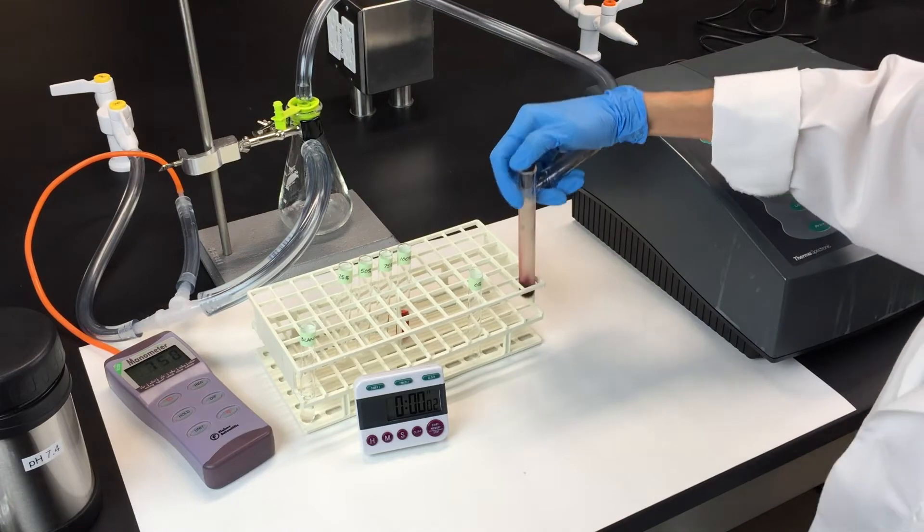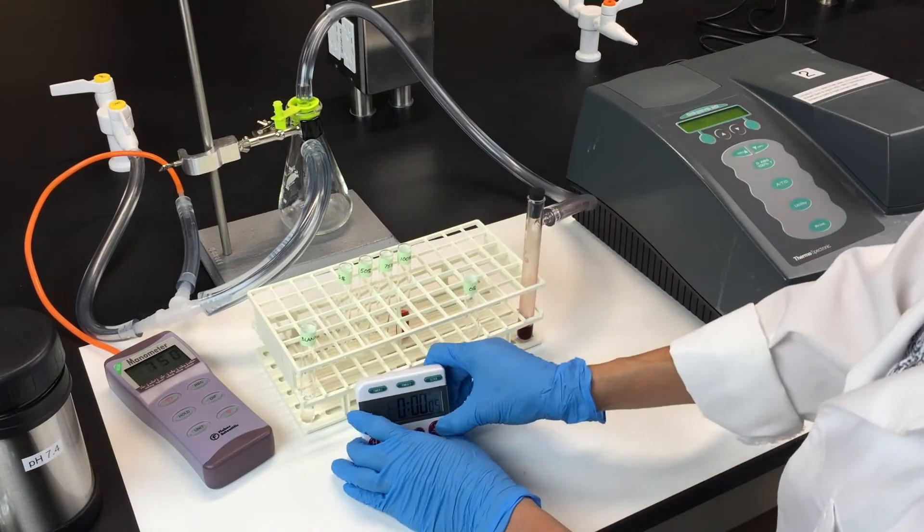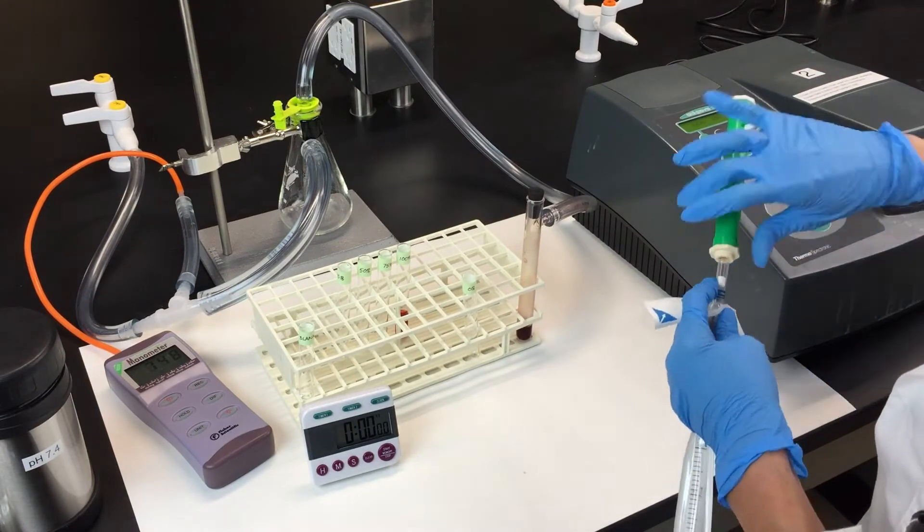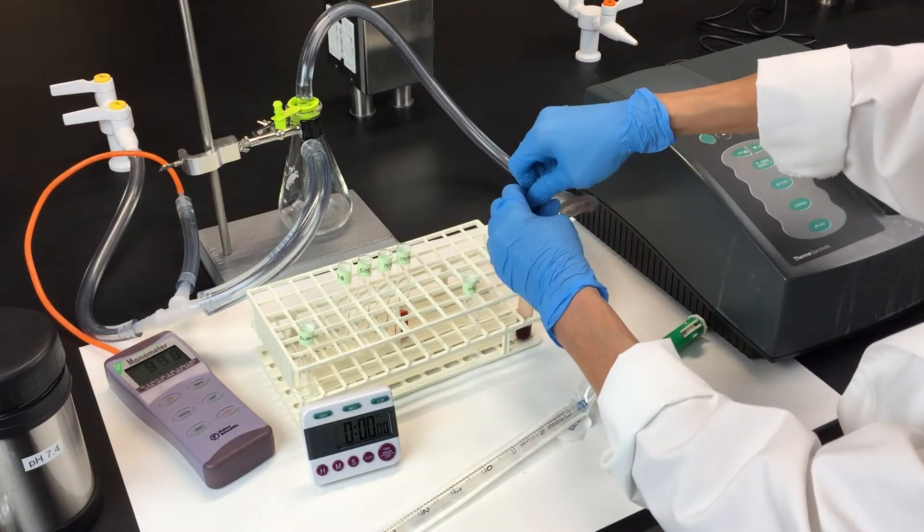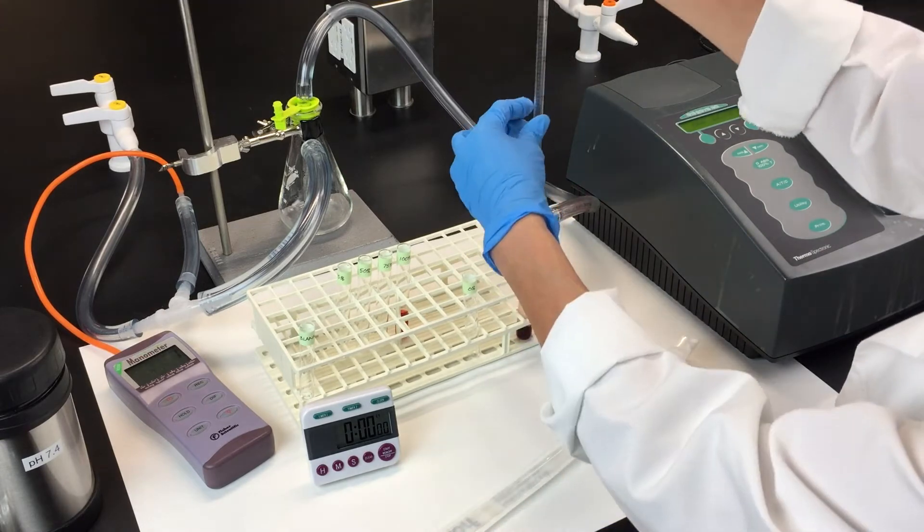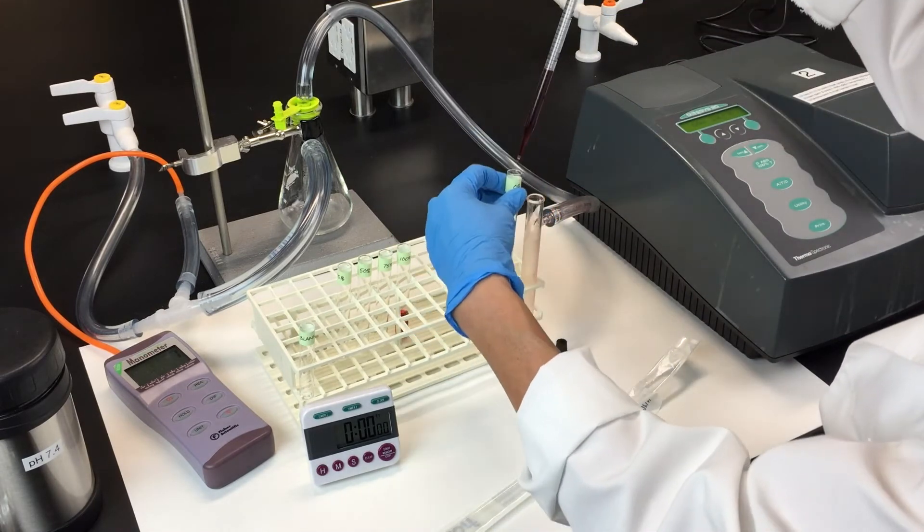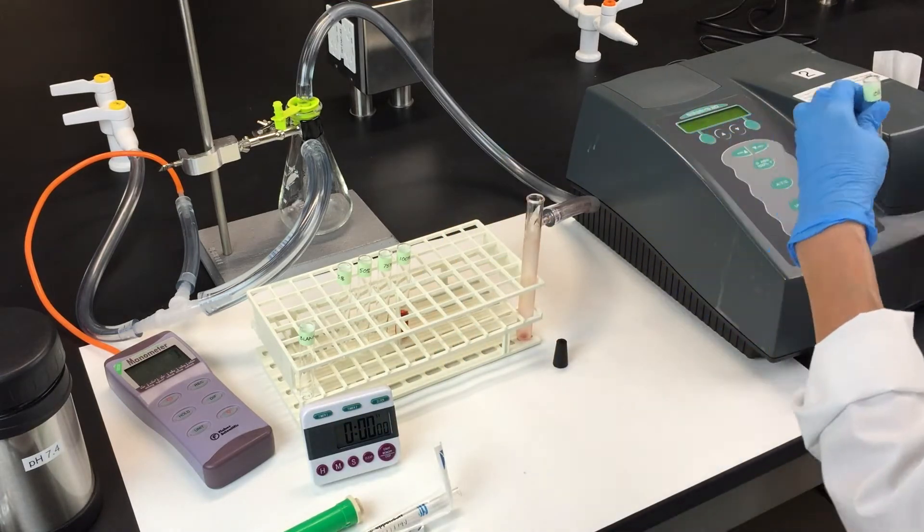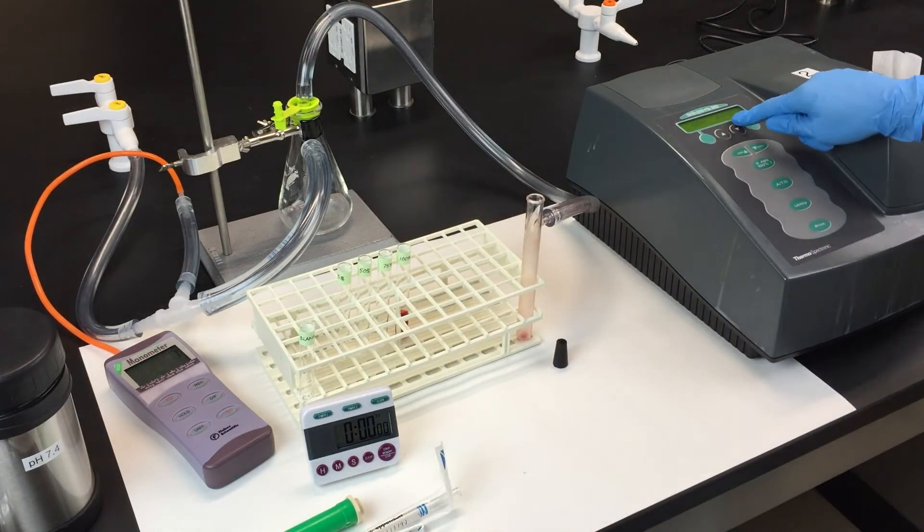After five minutes, the hemolysate should be fully deoxygenated. Turn off the vacuum and transfer the contents to the 0% oxygenation tube. Wipe off the tube, place it in the spectrophotometer, and take the reading.